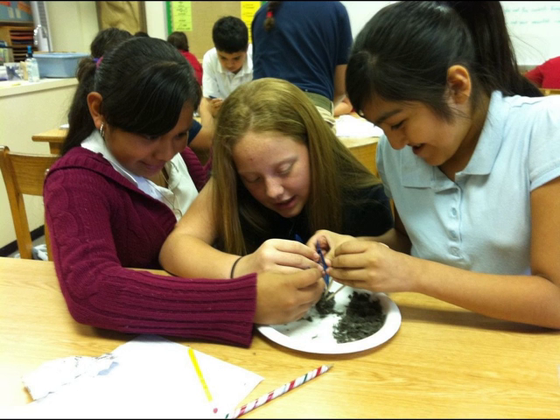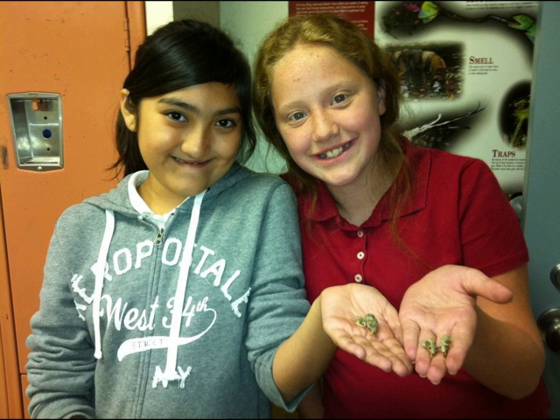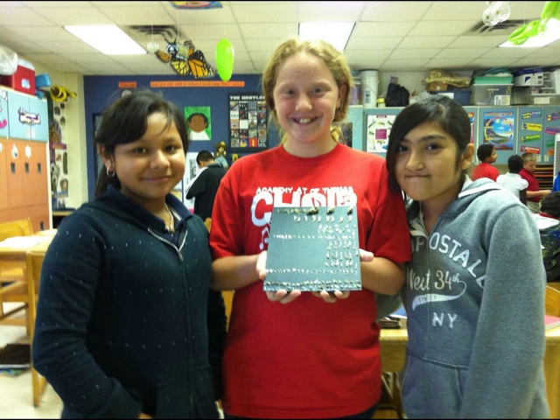When we dissected the owl pellet, it was different than any ordinary lab. It took 2 weeks and was amazing. In the owl pellet, we found many bones and 3 rodent skulls, and one of the rodent skulls was crushed up. It was so cool because it gave us a chance to learn a lot from owls. We learned many things about owls and what it eats, and if we could do it again, we would, because it was really fun and exciting.